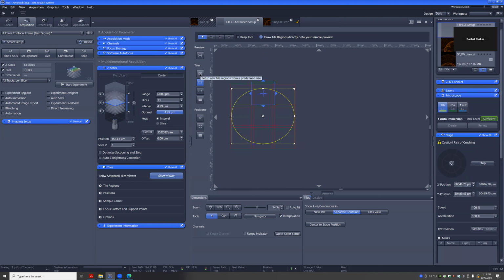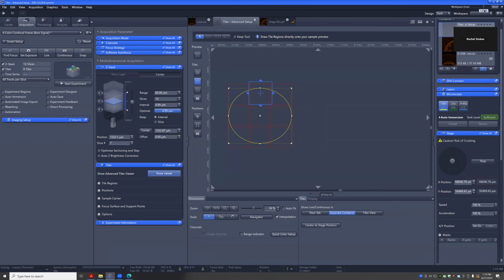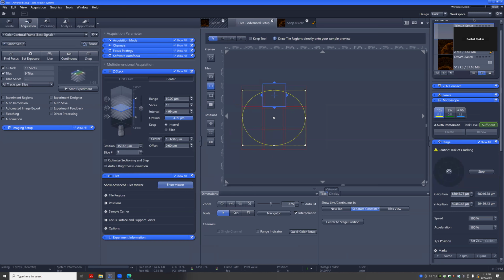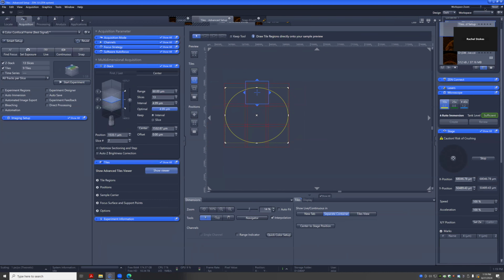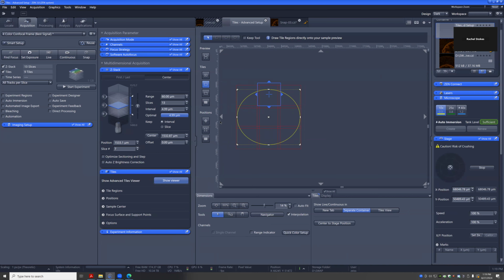Can we max the workspace? Oh yeah, let's bring that up a bit. Oh, that actually, well, it'll make the words bigger, but this view smaller. I mean, we could make this bigger, but yeah, it depends, right? You can play around with it a bit, but generally, you can zoom here as well. So if you use the mouse wheel, this will just zoom in and out of the map.